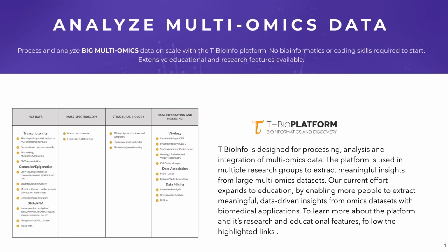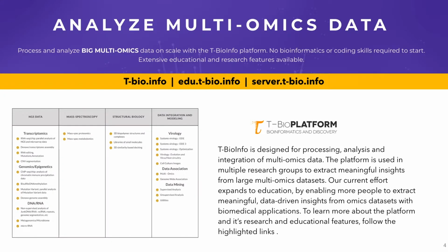In this lecture, we will be using the tBioInfo platform. We will use it to process raw data, so make sure you have the credentials you received with the course. If you don't have your credentials or have trouble signing in, please email me directly. The section we will use is under NGS, Next Generation Sequencing Data. It is called RNA-seq/CHIP, Parallel Analysis of NGS and Microarray Data.